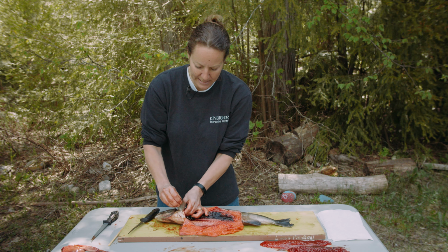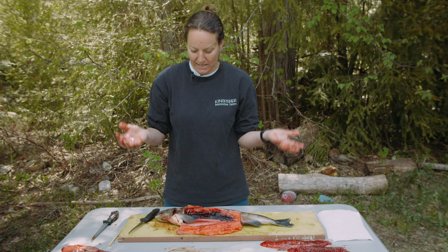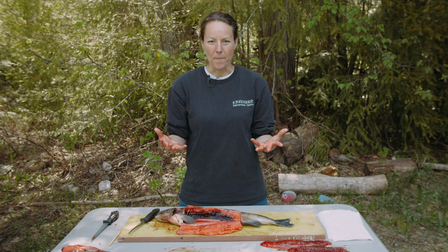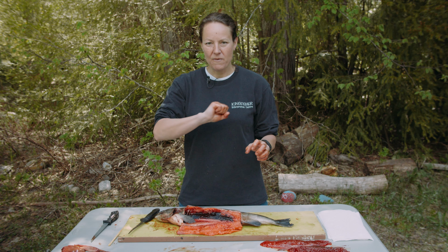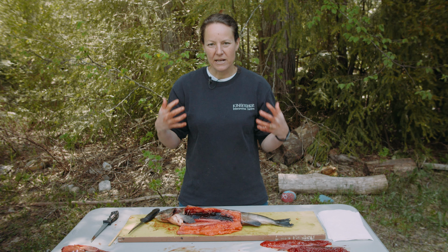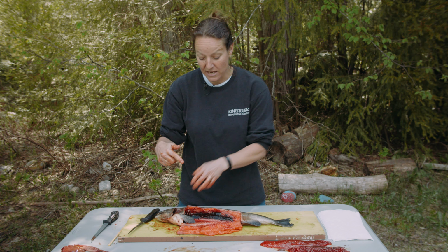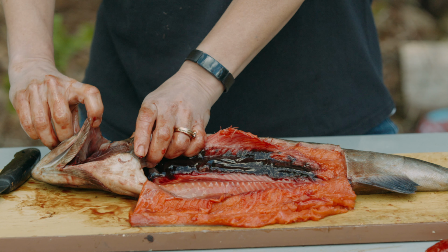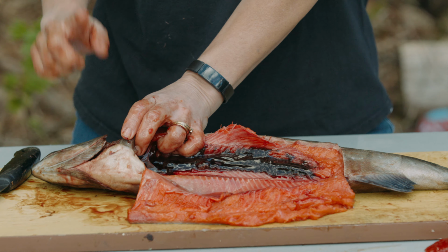Okay, now we're missing an organ. My goodness, what organ are we missing? We're missing the organ that pumps that blood through the body. So boys and girls at home, where is your heart? Our hearts are located right about here, right behind our ribs, next to our lungs, and they're protected. Now the fish's heart is located right there. So its heart is next to its gills, and it's in its own separate compartment.